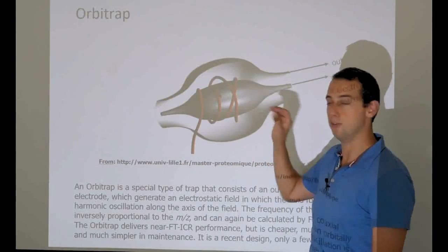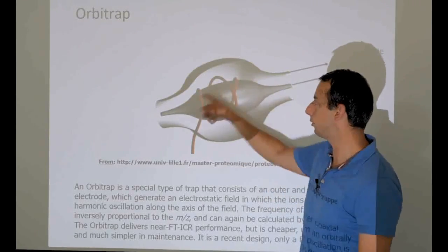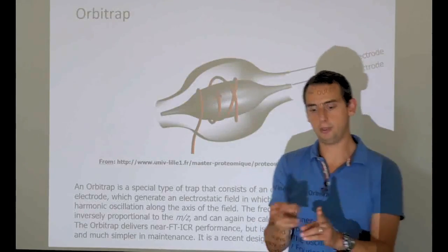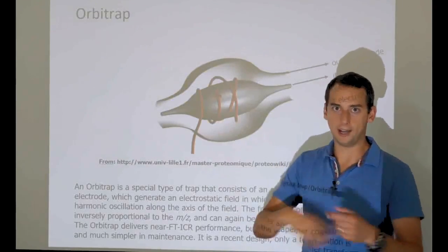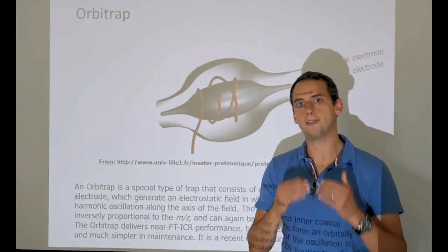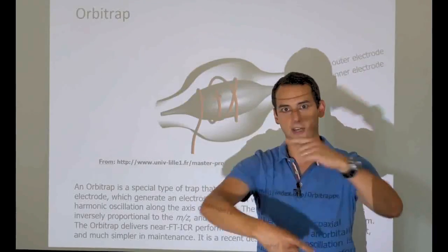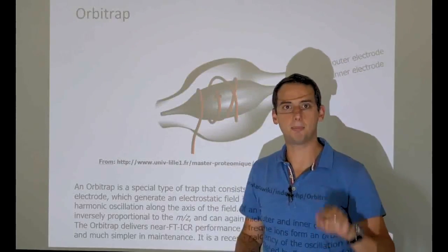It's very tricky to read out that movement, because you have electrodes, you have ions moving around in many directions, and the real trick of the Orbitrap is not getting the ions to make that movement. The real trick is to read out the current that is induced by moving along the spindle electrode. But as soon as you can do that, you get a frequency again, and the frequency is the back and forth frequency along the spindle, and that is a superposition of all the ions that are jostling for space in that trap, and again you need a Fourier transform to deconvolute that into the individual frequencies. So it's very similar to the ion cyclotron resonance instrument, but it sacrifices the whole complexity of having a cyclotron in which the ions make simple movements for a much more complex movement in a much simpler device.